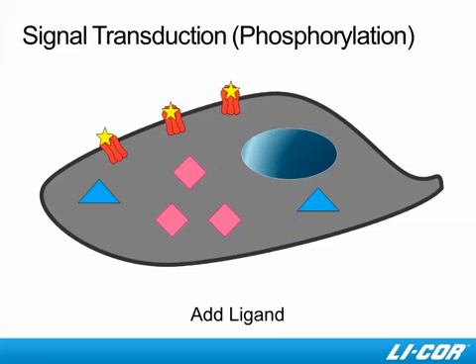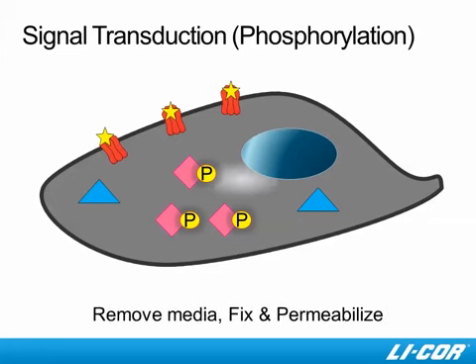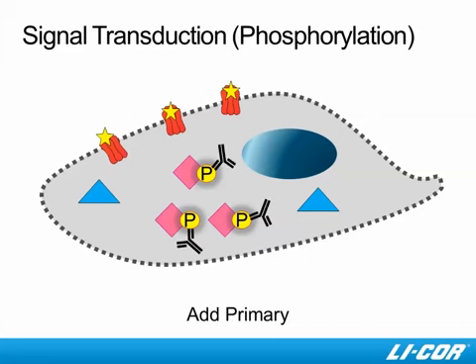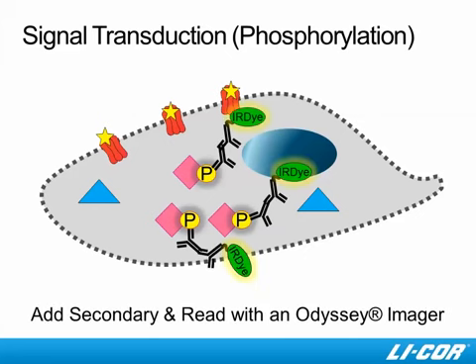In this example, we seed our cells of interest, and these cells express a receptor, let's say the EGF receptor. Once those cells are at the desired confluency, we go ahead and add our ligand, such as EGF. Once we've added our ligand, we'll have phosphorylation of downstream targets, such as ERK. Once we're done with the incubation step, we remove media, fix, and permeabilize those cells.